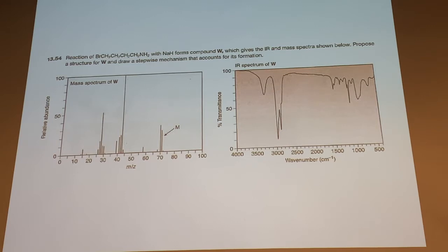And then in the IR, we see a little bit of an absorbance here at over 3,000. And that's going to be an amine, a nitrogen with 1 hydrogen on it. It's smaller than an alcohol, an oxygen hydrogen hydroxyl group. That one is much bigger because of the higher electronegativity, larger dipole moment when we oscillate that bond stretch there. So the amine is smaller there. So it's not an alcohol. Plus, we don't have any oxygen here in the reaction, okay?